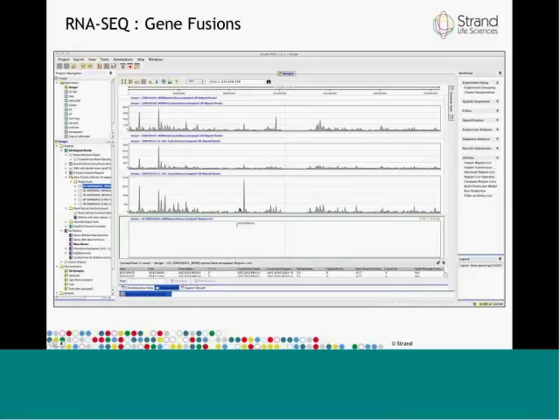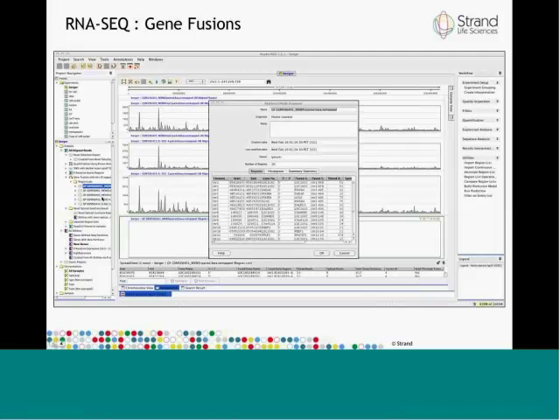When you do that in this particular case, you see that there is only one gene fusion detected in chromosome 1. When you carefully inspect the gene fusion results in this sample, you can do that by just double-clicking the result node here. You see that the total number of regions, gene fusions that were detected were 26.